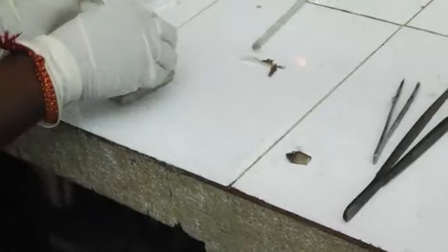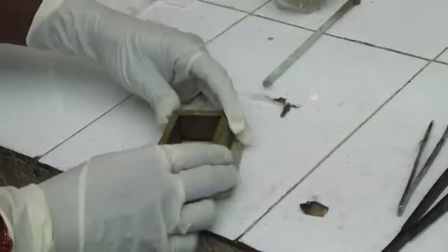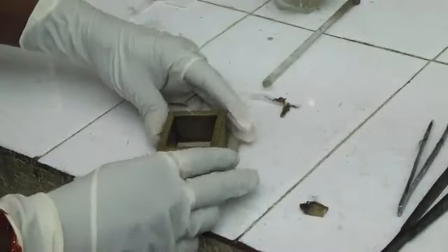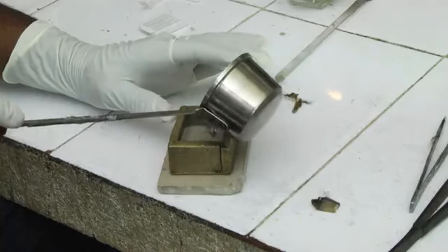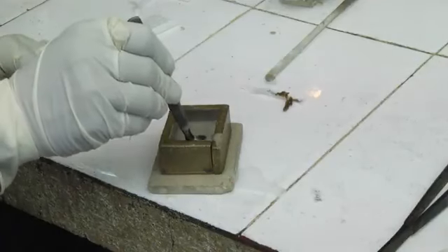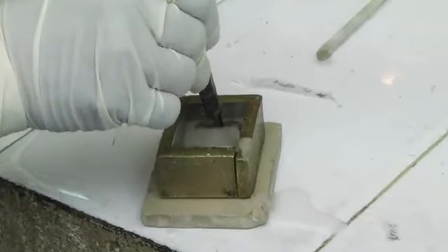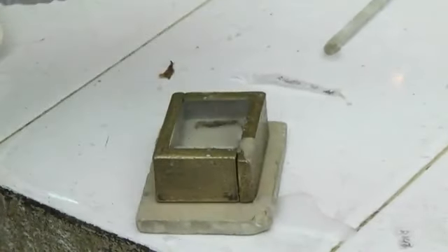For embedding the tissue in melted paraffin, metallic molds are used. At first, lubrication of the metallic molds is done by liquid paraffin. After that, melted paraffin is poured in and the tissue is carefully embedded in proper plane at the bottom of the metallic molds. It is important for technician to have a sound knowledge of basic histology and tissue orientation to be able to embed in the correct plane so that all layers of tissues can be visible on the slide.